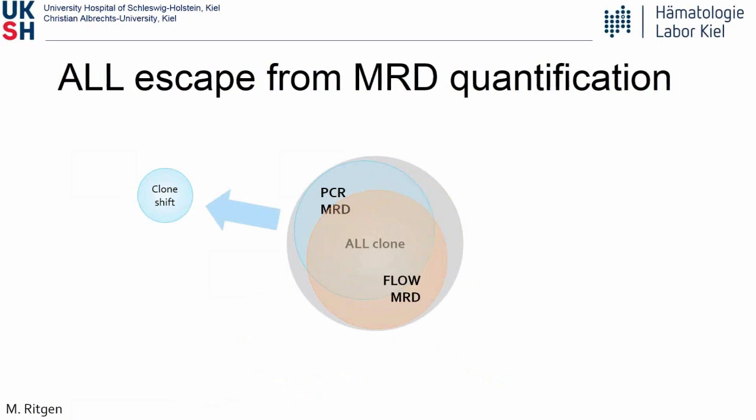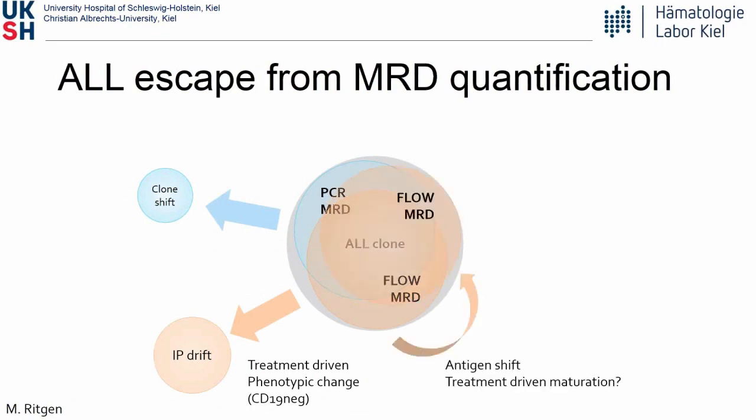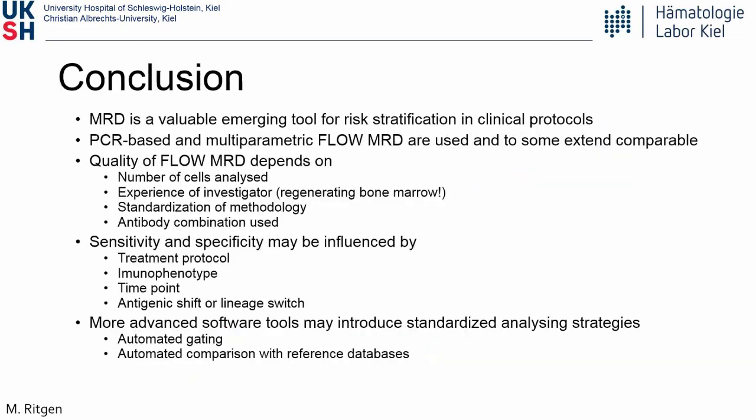I showed you CD19 negative cases in follow-up, or antigenic shift, like treatment-driven maturation, CD10 loss by treatment over time, or, as I showed you just before, the lineage switch phenomenon, which may either be treatment influenced or genetically predefined. We don't know yet. There are several groups working on this to identify which parameters may lead to this phenomenon. So flow MRD is quite a demanding technology, I think. We are coming into a phase where it is more and more widely used with standardized techniques introduced by the Euroflow community, but also by other groups like the IBFM or the US groups.